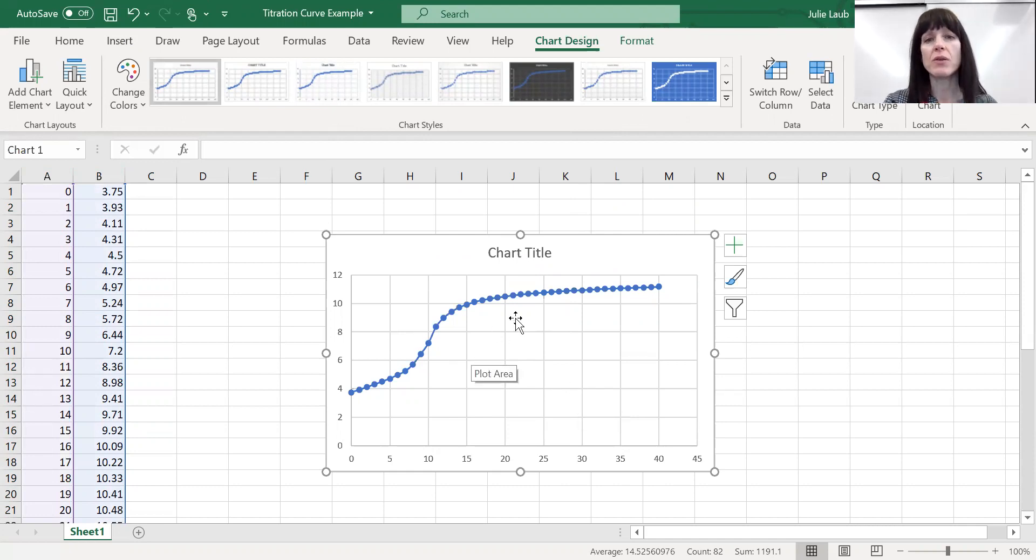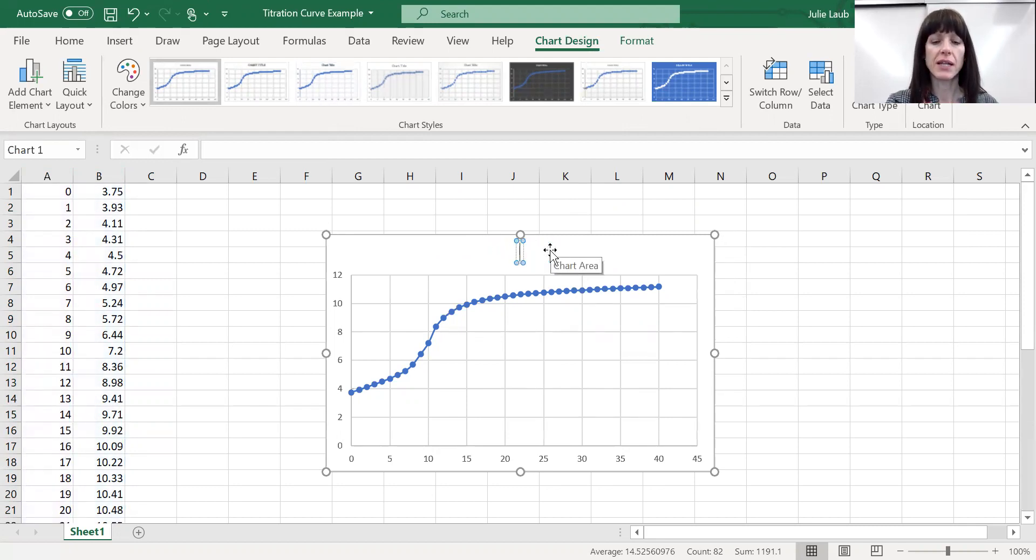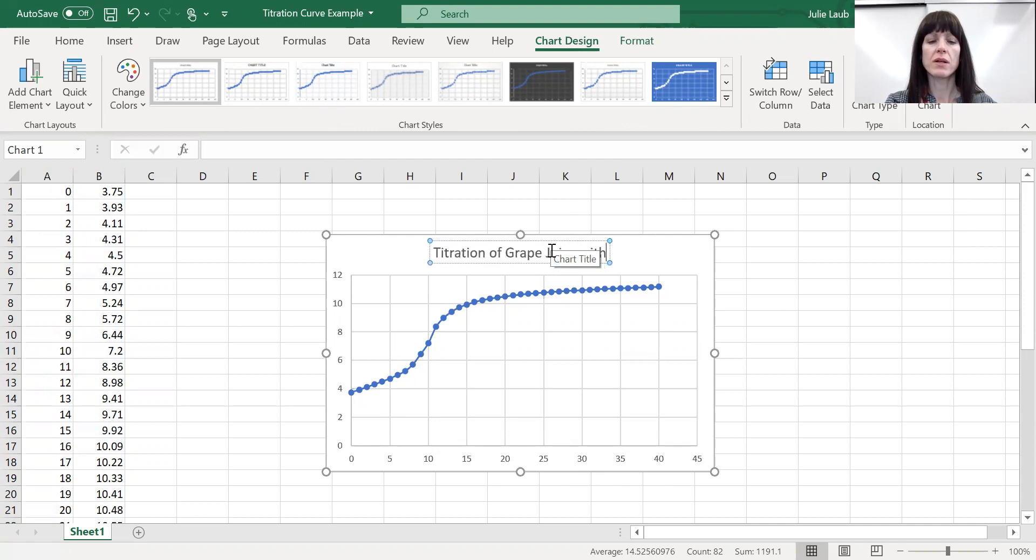Now at this point, you want to make it nice and clean. I'm going to go ahead and label in this what we did for the titration. This was a titration of grape juice with sodium hydroxide.